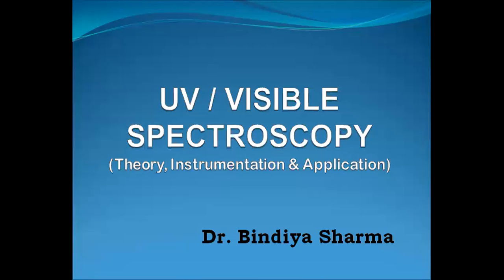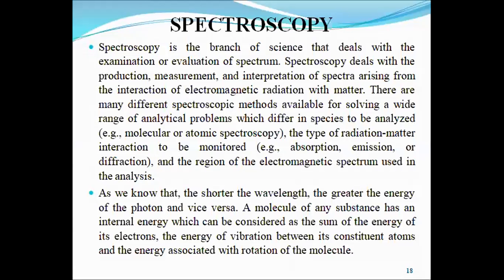As we know, spectroscopy deals with the study of a spectrum which arises due to interaction of electromagnetic radiation with matter. We also know that the relationship of wavelength, frequency and energy is given by E = hν or E = hc/λ. Energy is directly proportional to frequency and frequency is inversely proportional to wavelength.